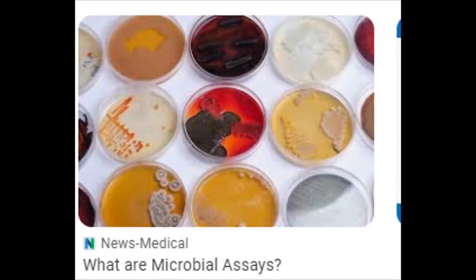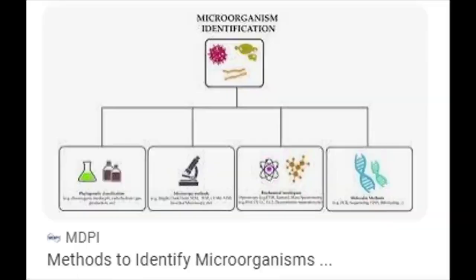Those ones grow at elevated temperatures. Then we have the psychrophiles. Those ones grow at lower temperature. So most of the microbes we find around us are mesophiles. Their temperature is around just a little bit above ours, or below, or exactly. That's why in the incubator, we incubate at 37 degrees Celsius for 24 hours for bacteria.